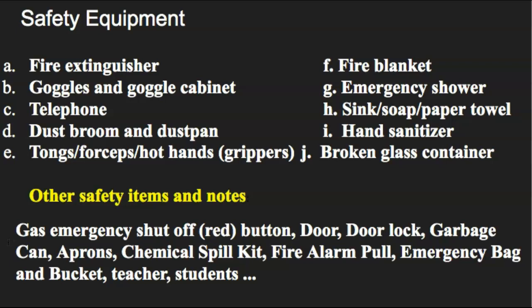The teacher, great resource for safety information. Maybe you put that down on your list, maybe you didn't. And students, you are the first front. As a teacher, I cannot see what everyone is doing at all points and times. I try to be observant. I do my best. But sometimes people do things that look like they're going to be safe, but then they switch and do something else, and then it's not safe. So you have to look out for each other to keep each other safe.